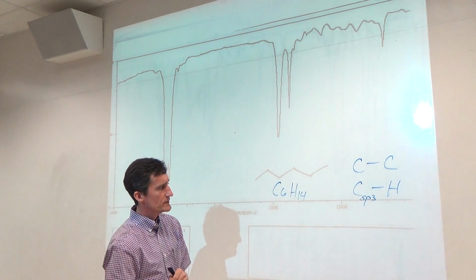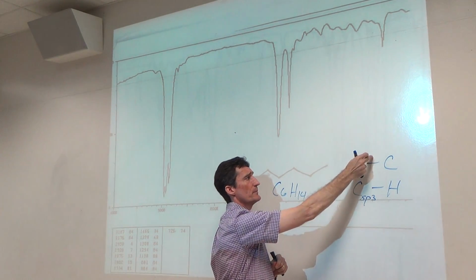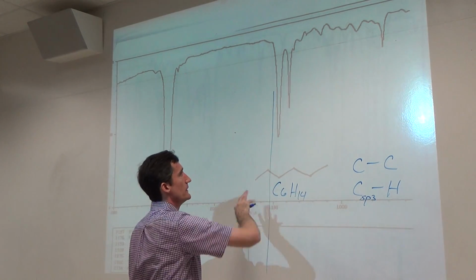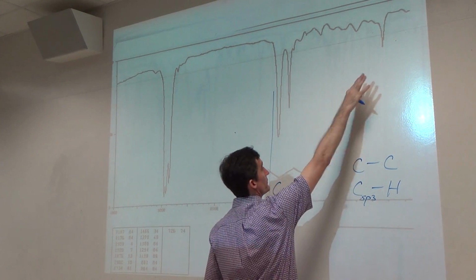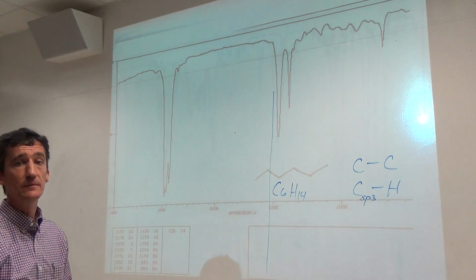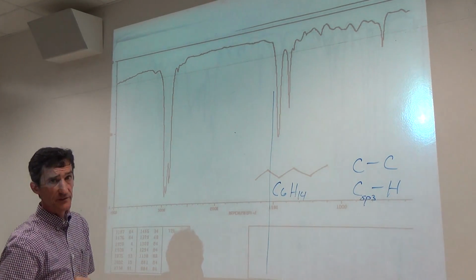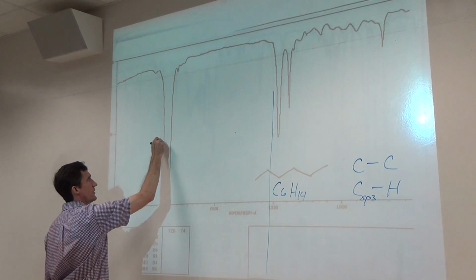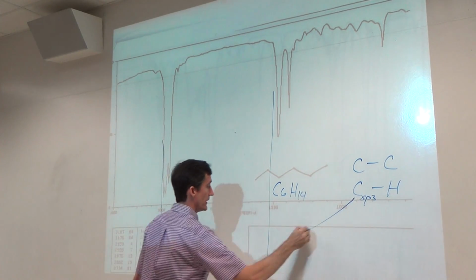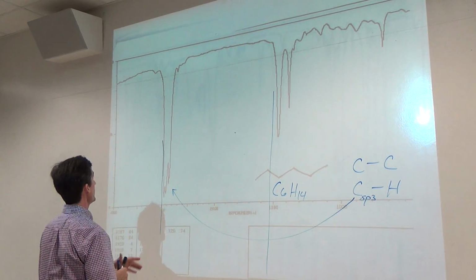Where do these give absorbances in the IR? This is a single bond that does not contain a hydrogen, so this is going to be fingerprint. Fingerprint roughly about here, down somewhere. That or that is due to the C single bond. We don't need to identify it. What is this down here in the non-fingerprint region? We should identify that. Pretty substantial absorbance just below the magical line of 3,000. Well, we know that that is our sp3 CH. Okay? There you go. Nothing else there.